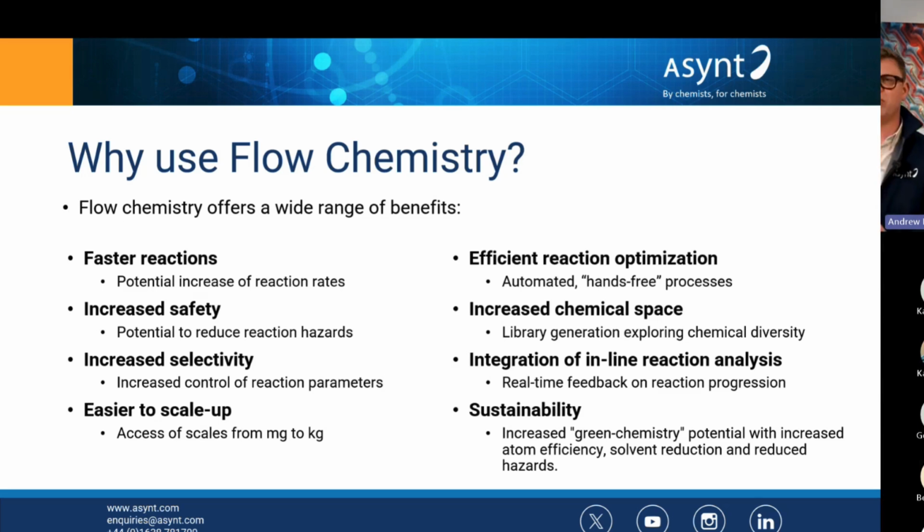And then we can add those principles of automation to make small arrays of material, of compounds of interest. If we're looking at early drug discovery process, for example, when we want to make lots of analogues, we can automate that process where we take the concepts of optimization, where we have varied our reaction parameters to find the ideal. And then instead of exploring the reagent screening with an automated sampler, we can have a series of monomers to build up around different scaffolds to build a library of compounds to increase that chemical space and increase diversity.